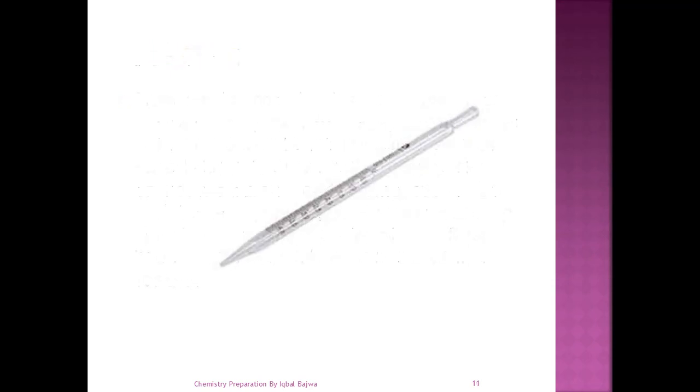This slide shows a typical pipette. So we can measure the exact volume of the liquid with the help of a pipette.